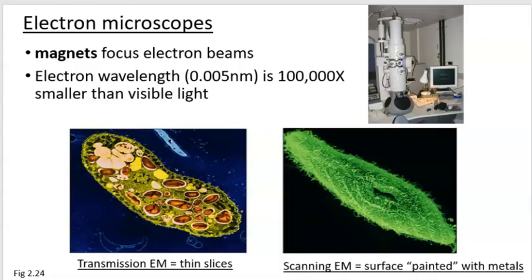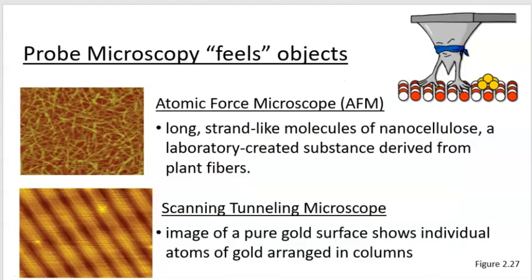And we can go even further than this. When you look at what's known as probe microscopy, this little cartoon I found out there is really telling you what's going on. You have a probe, think of it kind of like a seesaw, that is reaching out and touching the atoms in your specimen, and that seesaw is going to bounce up and down as it feels the end of this. And on the other side of this, you're going to have a laser that is going to detect when your seesaw moves up and down right there. So you are literally feeling the force of the atoms.